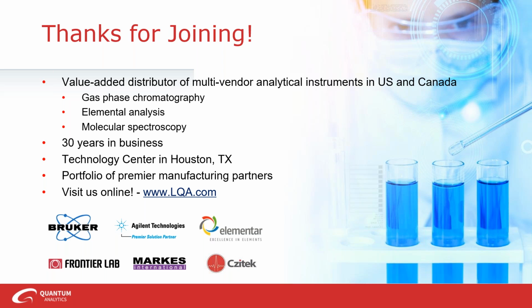But I can say that I have seen a number of people who will collect one. They will have a standard material, and they will collect that piece of data. And then as long as you're using the same instrument and the same optics and the same experiment, the same scan parameters, it's very easy to overlay a reference pattern.